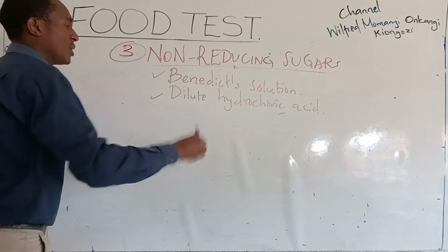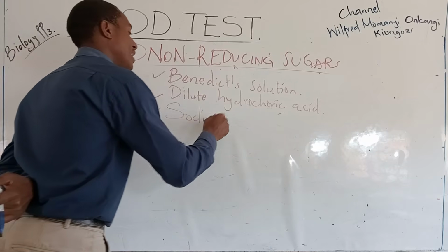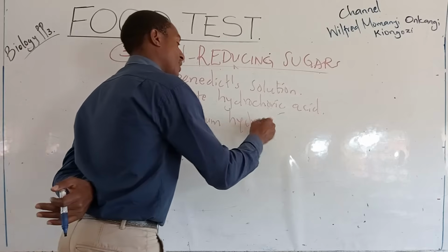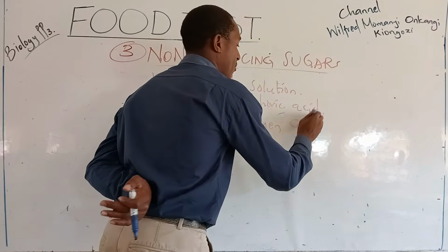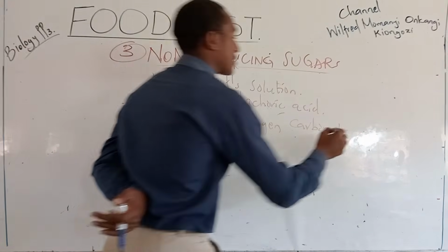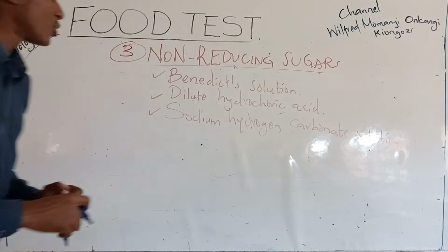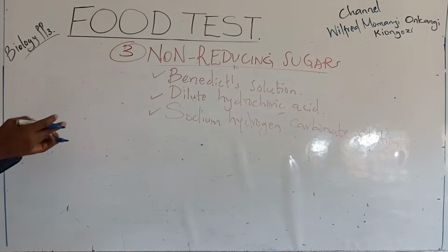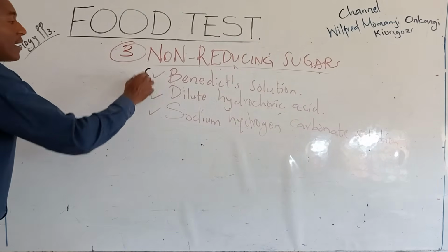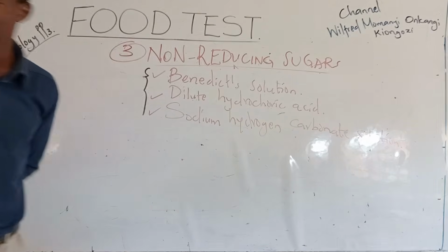We have another one called sodium hydrogen carbonate solution. I think those are the three substances or chemical reagents that we shall be using.